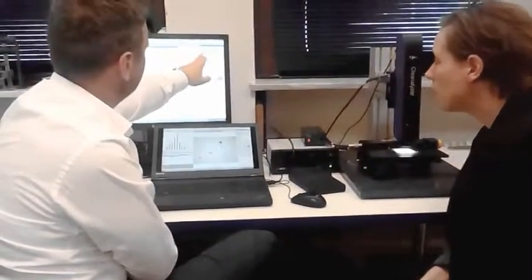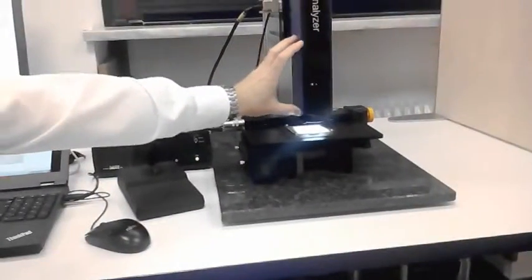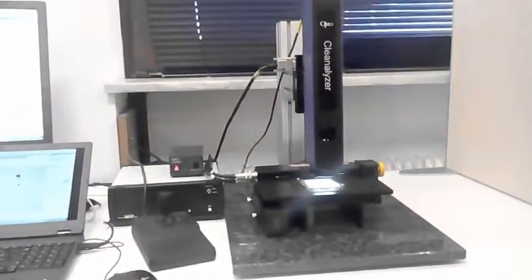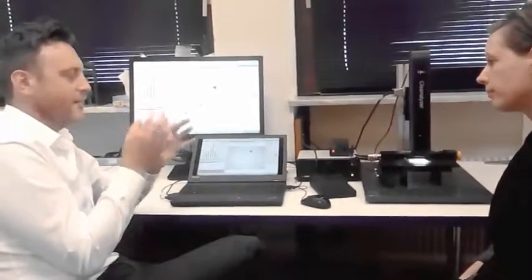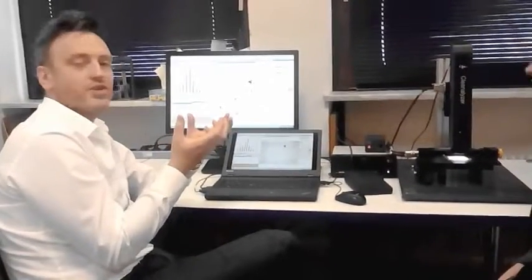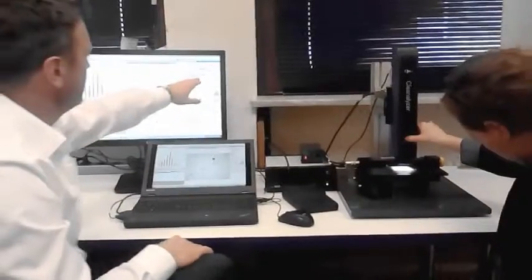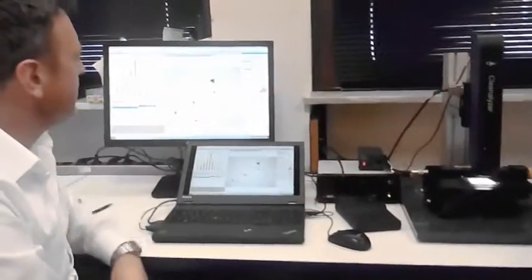So we've connected our joystick. Now on the front here, we have our magnification settings. I mentioned that there is a zoom system inside here. This allows us to change the magnification of the system and to zoom optically, not digitally, if we wanted to get a much finer, much higher resolution to start imaging much smaller particles. Of course, as we increase our magnification here, our runtime increases. So we are running at 0.75 here. We've already inserted that into the system.